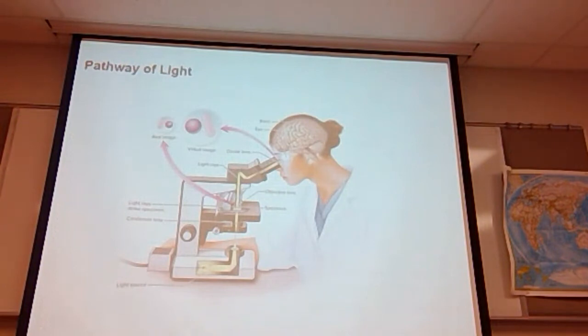The pathway of light, again, I will never ask you to draw this cutaway version of a microscope. What I want you to see in this structure is that a microscope is a very complex piece of equipment. I cringe every year when I see students taking a microscope and literally dragging it from one side of the table to the other, to the point where as they're dragging it, the microscope is literally bouncing like this.